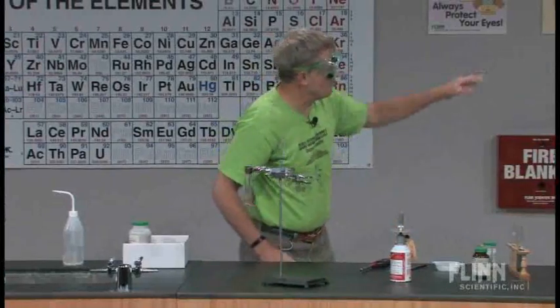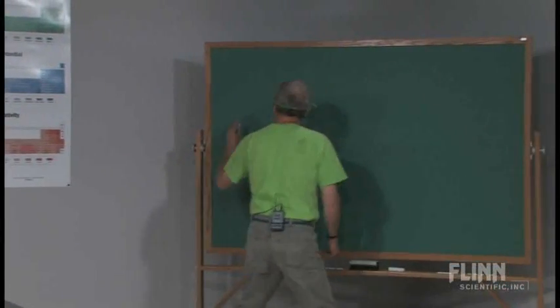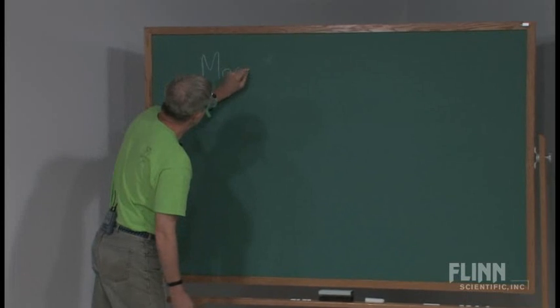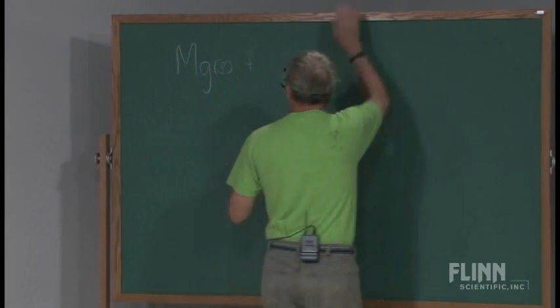So I'm going to go over the board real quick and write the reaction just so you have an idea what's going on. It's magnesium solid with water. And if I were right-handed, it would have worked.